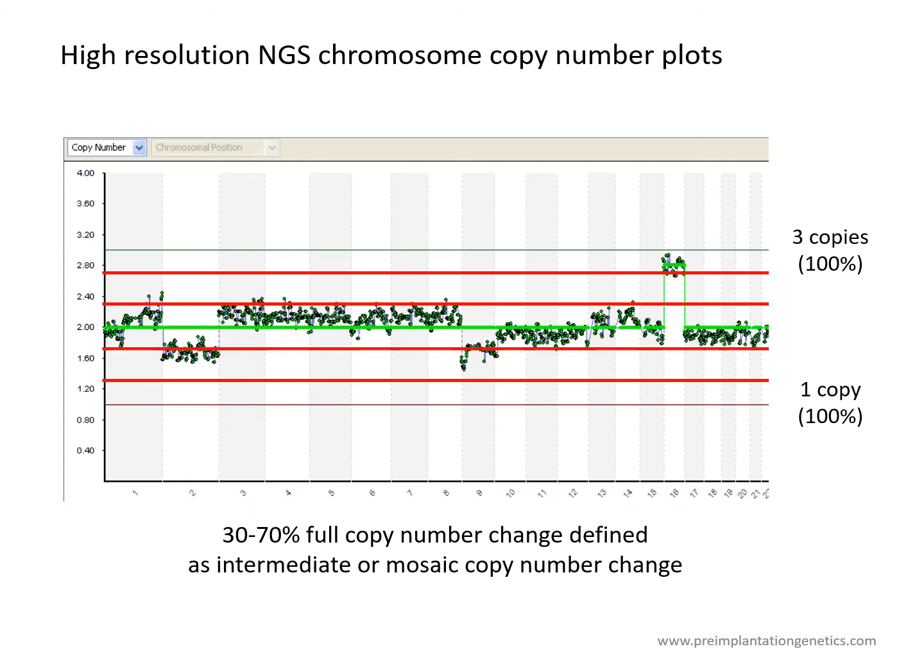whereas the other displacements are either on the line or beyond the line. So in this example, the trisomy 16 is likely to be reported as a full trisomy because it is beyond or greater than 70%, whereas the two losses are borderline intermediate changes at around 30%.